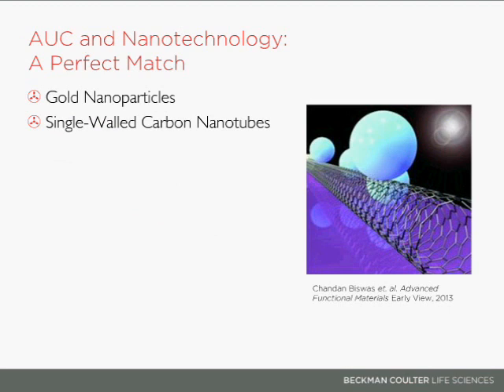With the core shell gold nanoparticle study, this is the study that was referenced earlier in the presentation from 2011. AUC was used to analyze the surfactant coverage on gold nanoparticles as well as derive the average molecular weight of the gold nanoparticles and confirm it with mass spec.